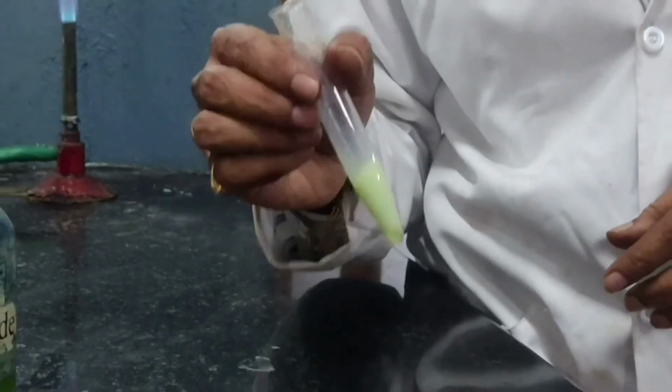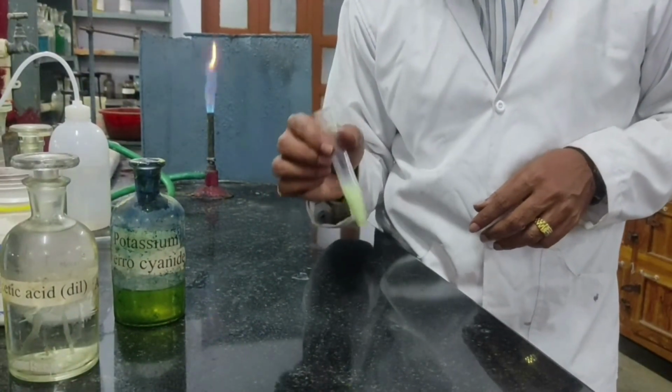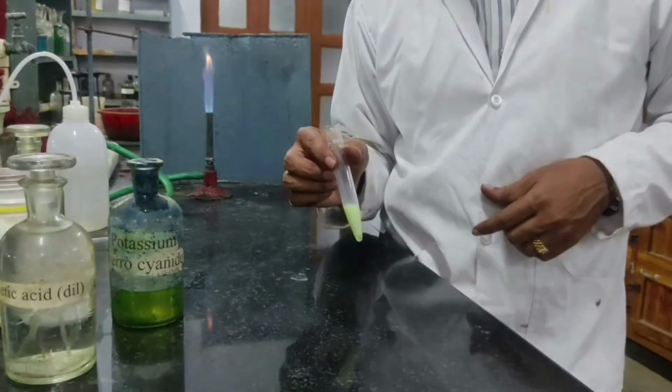This is how we are supposed to do the fourth group separation. This is how we are supposed to do the fourth group cation separation.